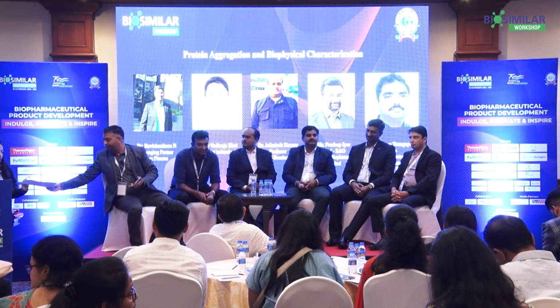Yeah. So last question, excuse me, please, to Dr. Pradeep. As you told, that ST should be less than 600 or max 700. But if there is a high content of excipients like phenol and some dextrose, how do we get rid of that then? Yeah, that's a good question. We have faced these issues. The industry standard practice is 700, but we internally target less than 600 to get a better profile.